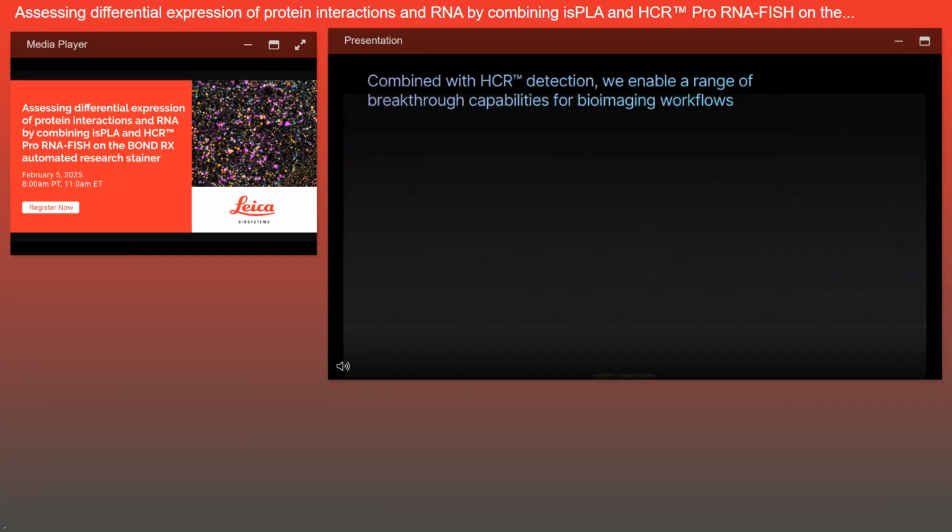So as for the HCR platform itself, this is a bit of how this amplification system works. We begin with these I1 strands on the bottom left. These are actually conjugated to the RNA probes themselves. These probes are designed in-house for our users. All the user has to do is provide us with the target sequences of their targets, and we conduct the probe design and synthesis all in-house. Once complete, these are conjugated to these initiator strands.